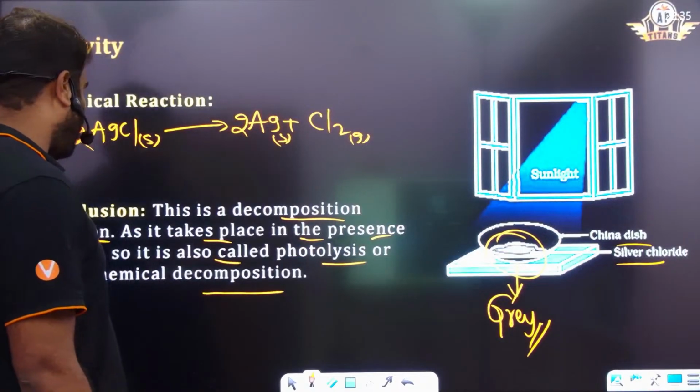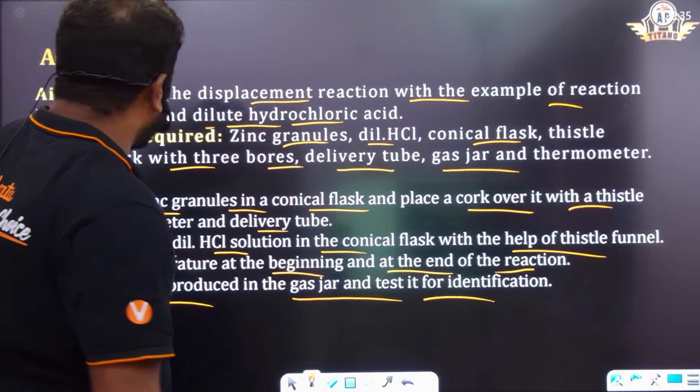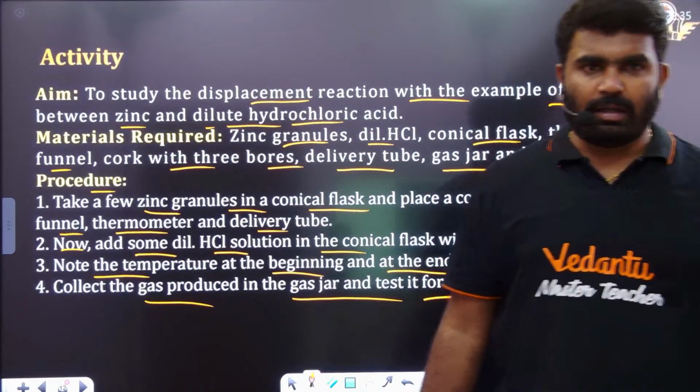Silver chloride. Okay, to study the displacement reaction with the example of the reaction between zinc and dilute hydrochloric acid, with the help of zinc and dilute hydrochloric acid.